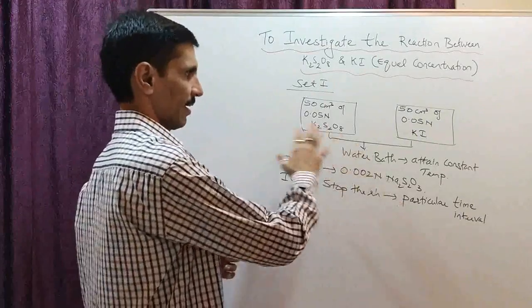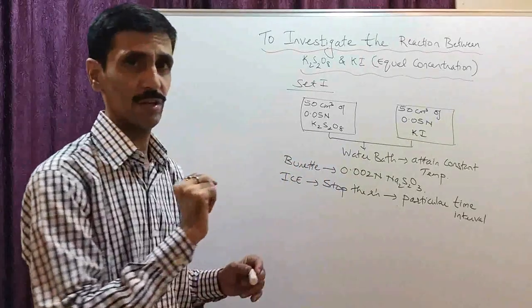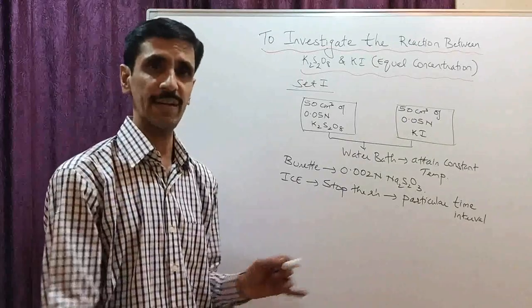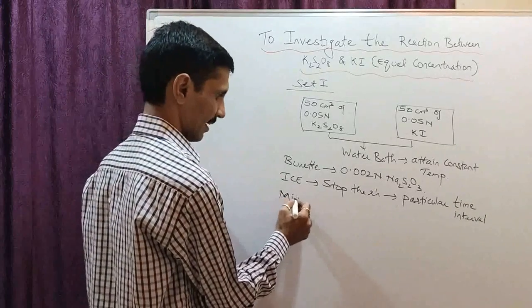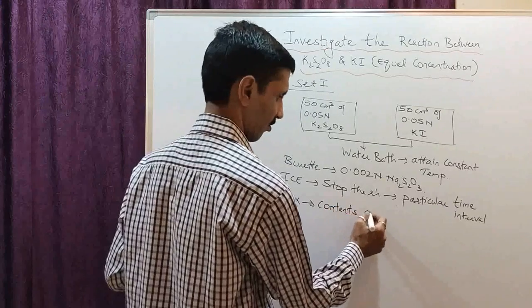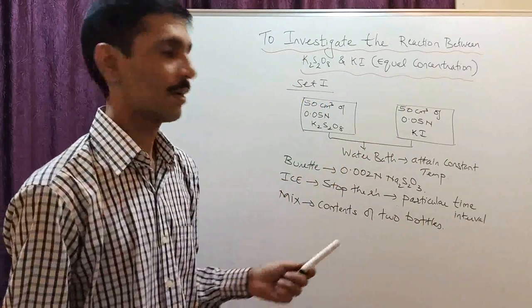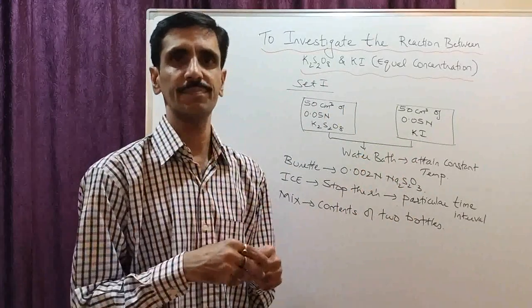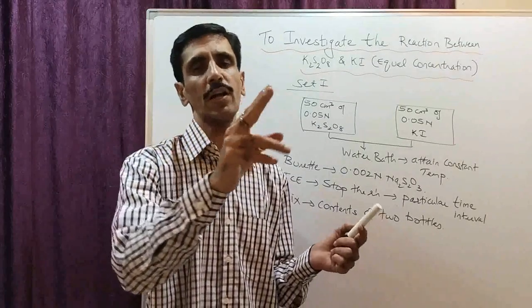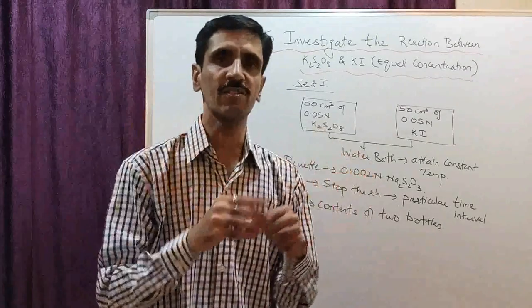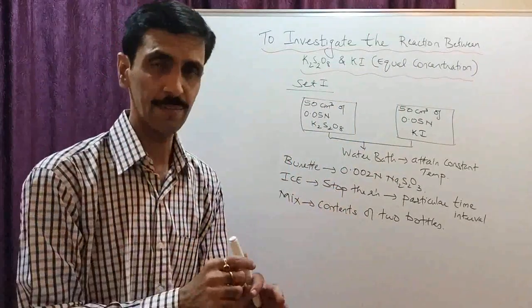Once all arrangements are in place — the starch indicator is prepared, the burette is filled with 0.002 normal sodium thiosulfate — next, mix the contents of the two bottles. You can transfer K2S2O8 into KI or vice versa, since both solutions have equal concentrations and equal volumes. After mixing, one bottle gets empty; keep it aside.